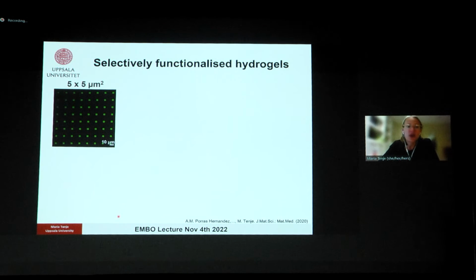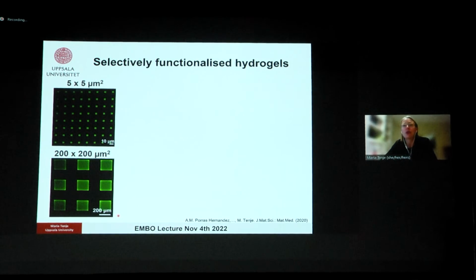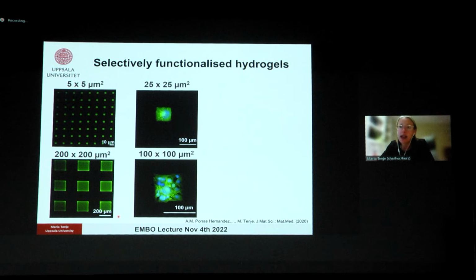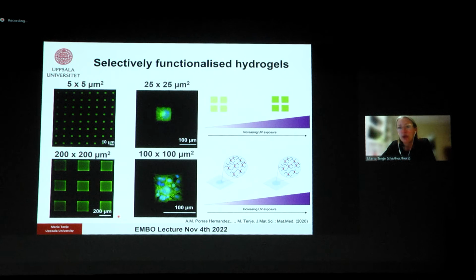And we could make structures down to 5 by 5 micrometers, going up to, say, 200. There is basically no limit to how large structures you can make. To have cells adhere, we need to have a minimum structure of 25 micrometers. And on the larger pattern areas, more cells would adhere. And again, increasing the exposure dosage increases the amount of RGD that we can bind. And increasing the exposure dosage, we could also increase the stiffness of the material.